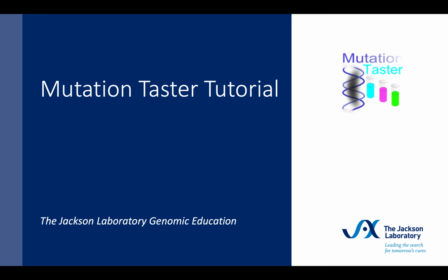Welcome to this tutorial on Mutation Taster. In this short video, you will learn how to use Mutation Taster to see the predicted effect of a gene variant on its coded protein.